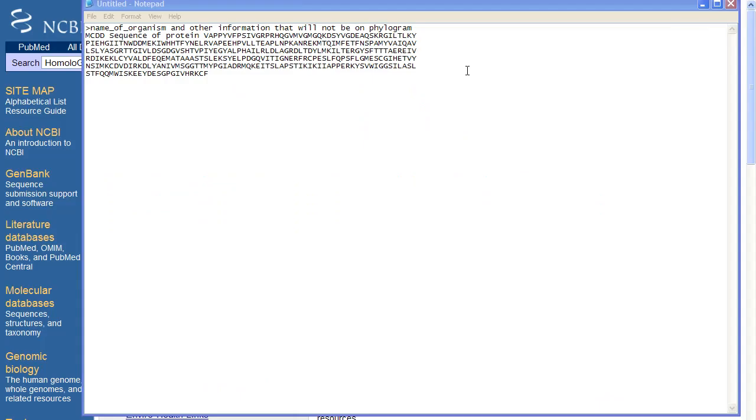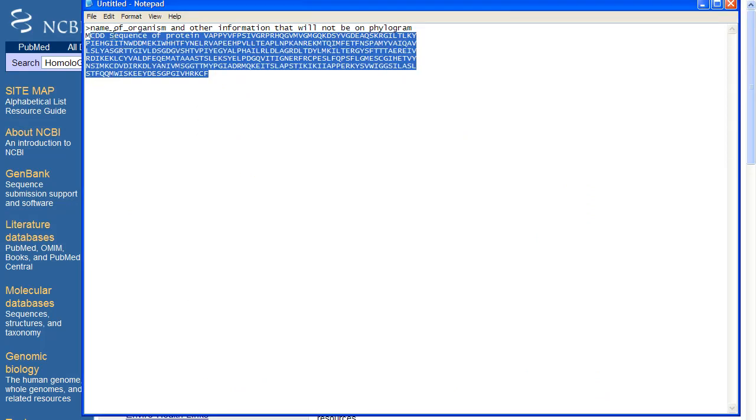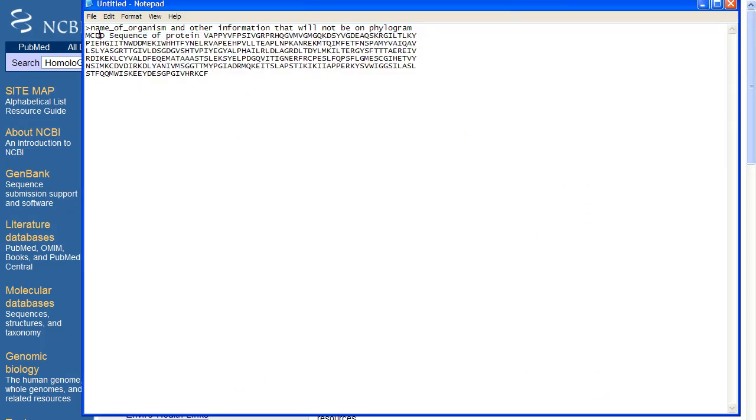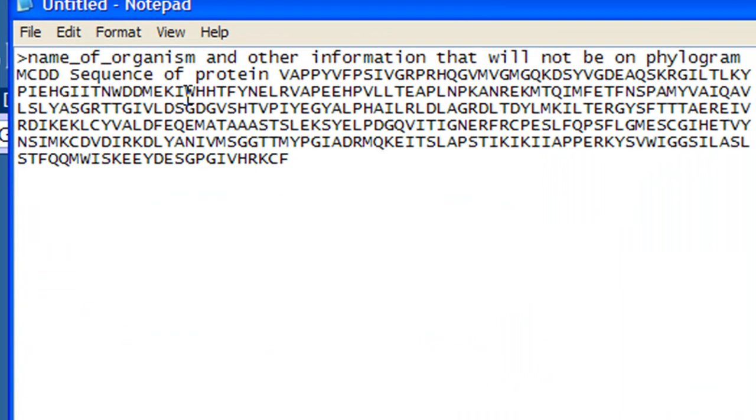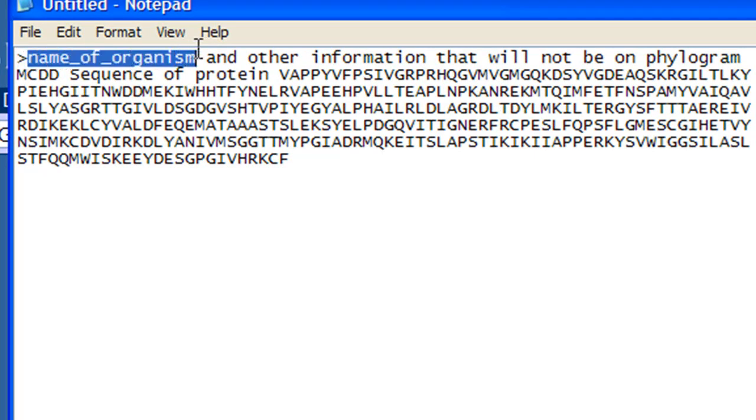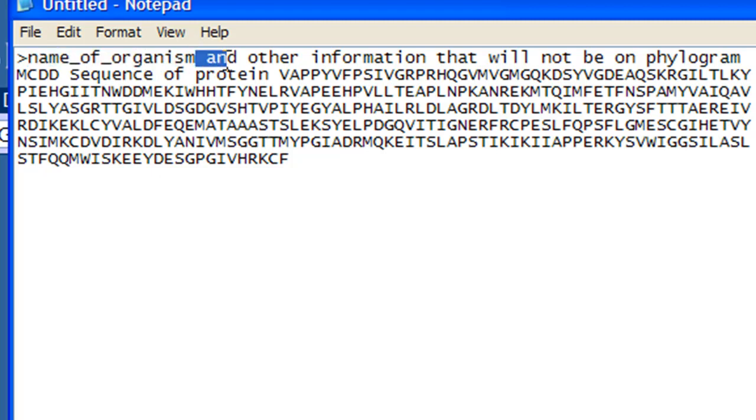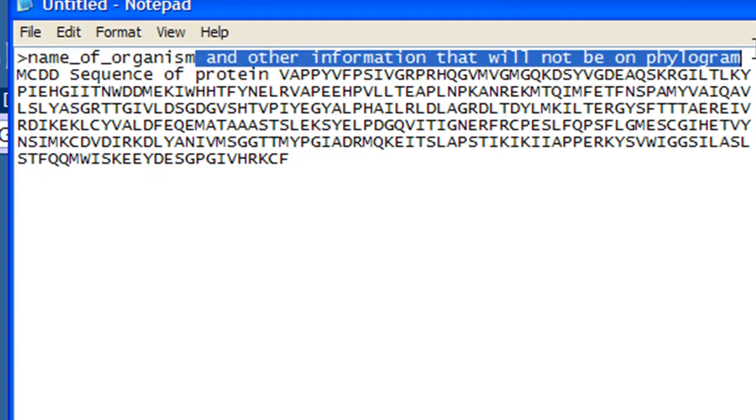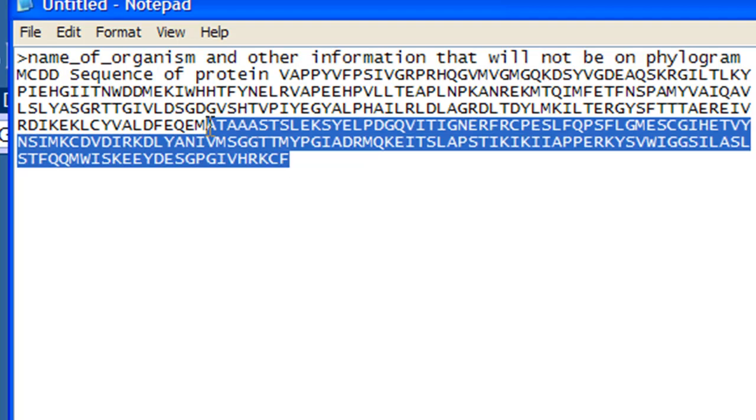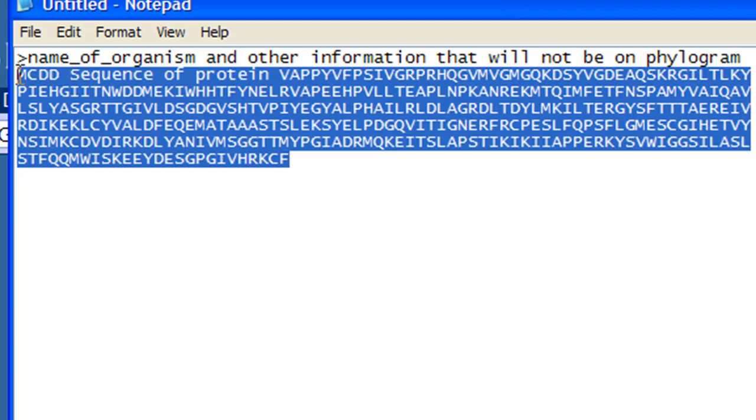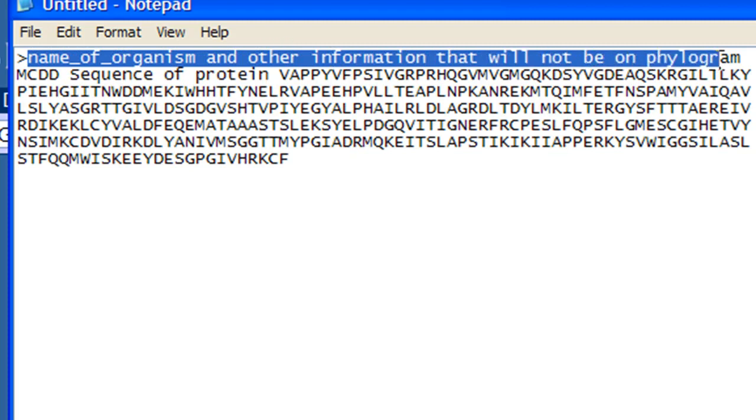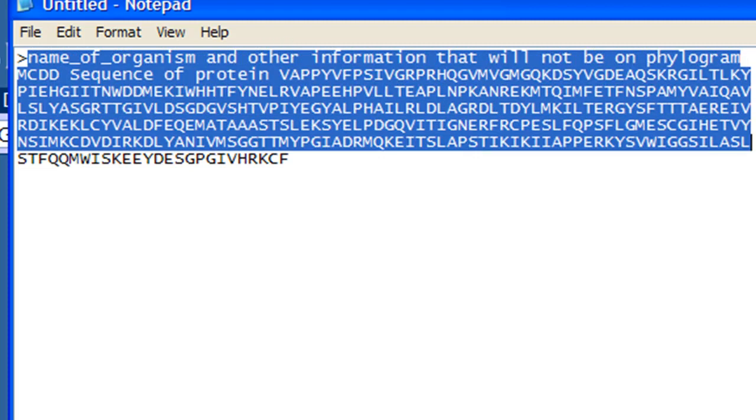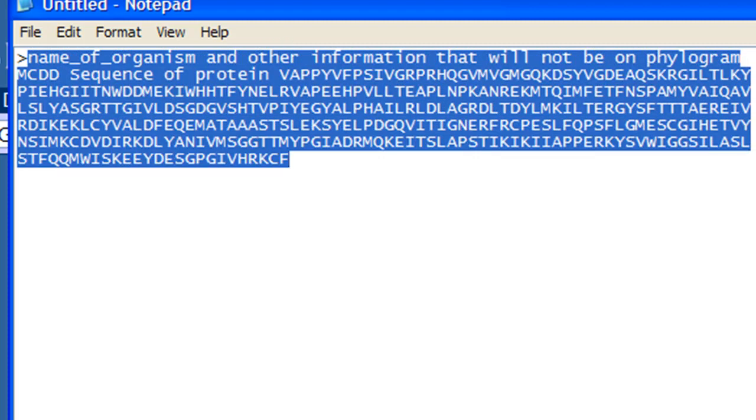Step 1, open up a text file using Notepad today. The format of this data is going to be called FASTA. The way it starts is with a greater than symbol followed by the name of the organism with no spaces inside. The first space will break it up, and this information will not appear on the phylogram. Here's the protein sequence. We're going to grab this out of a database, but I wanted to show you the format and the basic formatting. It's about as simple as it gets.